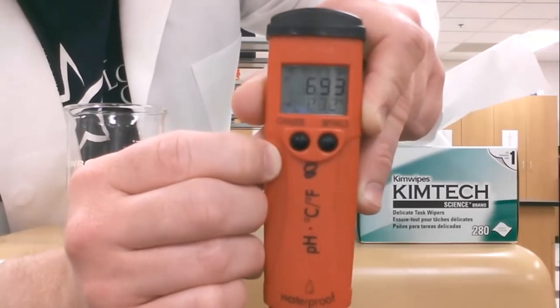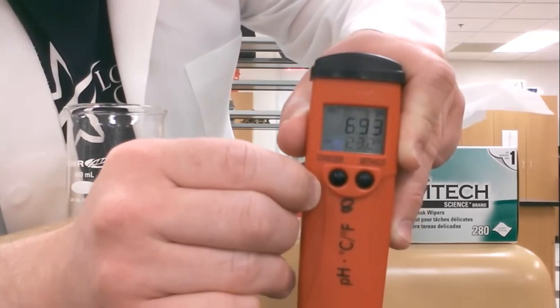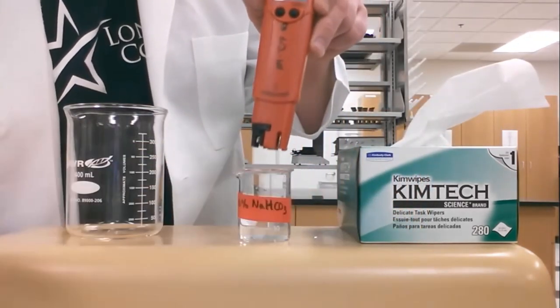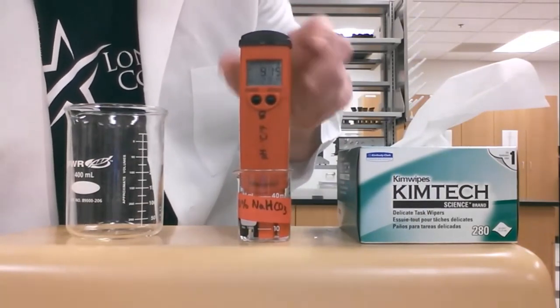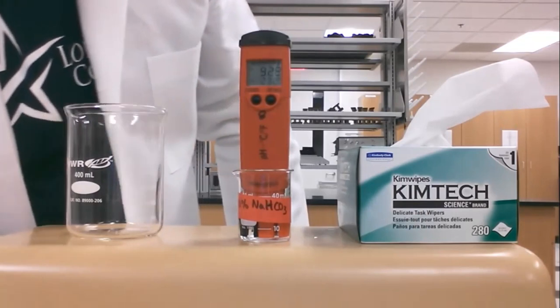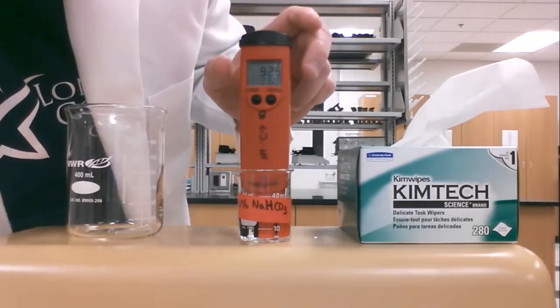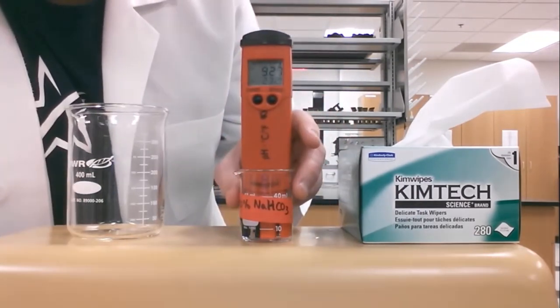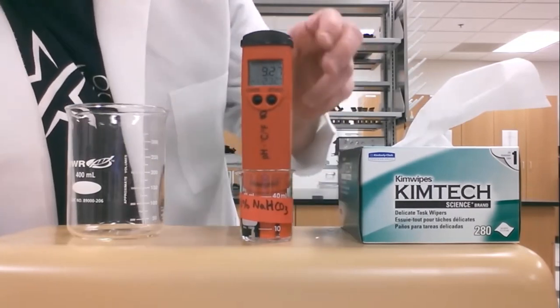Alright, so immediately you're going to see a pH reading. We're going to take the pH meter and put it into your solution, and that's going to give you the pH of the solution. Here we have a 9.27 reading for the pH, which is about right because sodium bicarbonate is slightly basic.